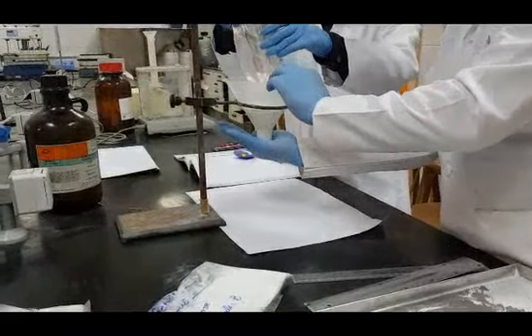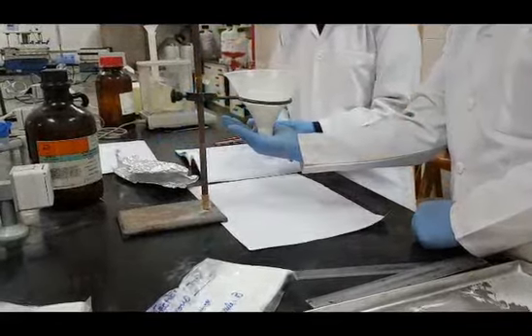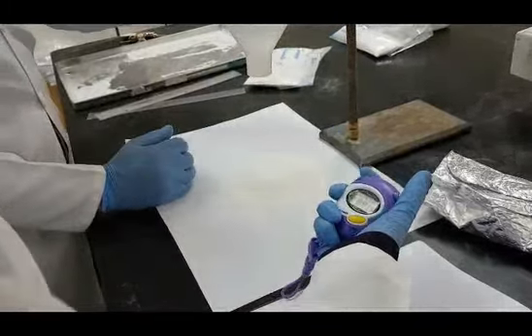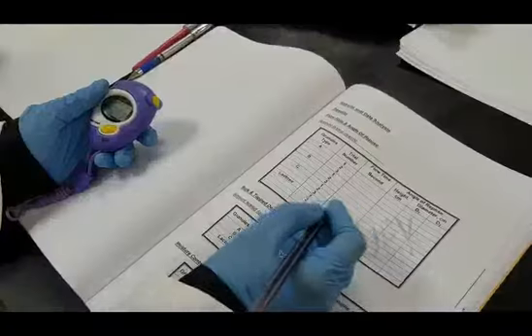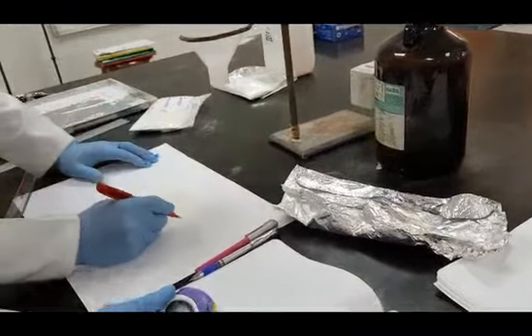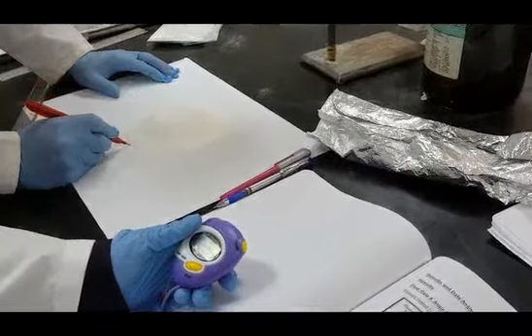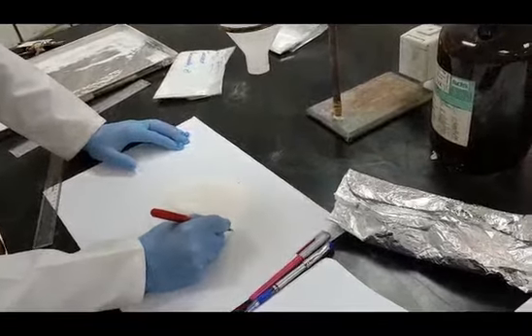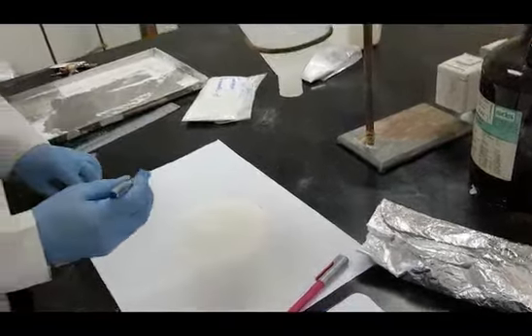The one who will close the funnel's small opening with his right hand and hold the funnel with his left hand. The one who is holding the timer will give the signal to start, and the one who is holding the funnel will give the signal to stop timing.